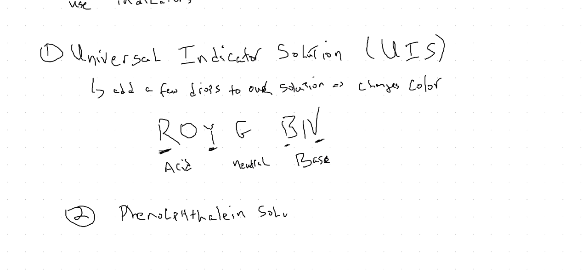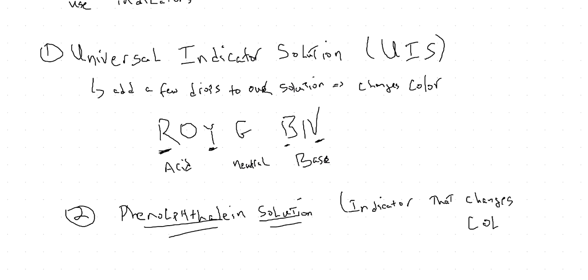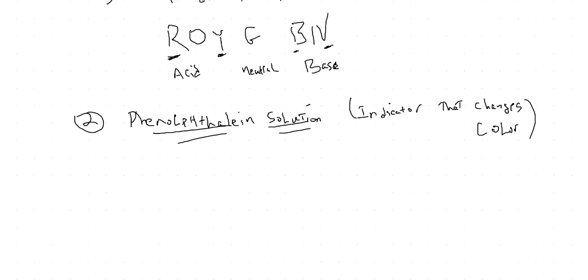It is not universal. Again, this is another indicator that changes color. Now, phenolphthalein, what happens? I'm not going to rewrite that word. It turns pink, like a Barbie.